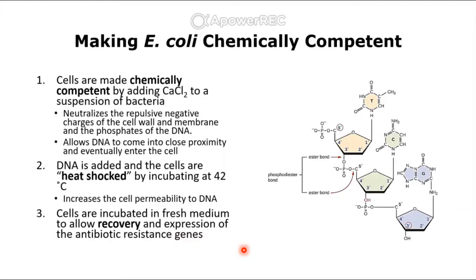And the most important one to begin expressing right now are those antibiotic resistance genes. Because remember, we're going to go from the transformation to putting these on plates that have those antibiotics present. So we need to make sure that they become resistant to those antibiotics before we plate them onto them, or else even though they have the plasmids present, we'll end up killing them.